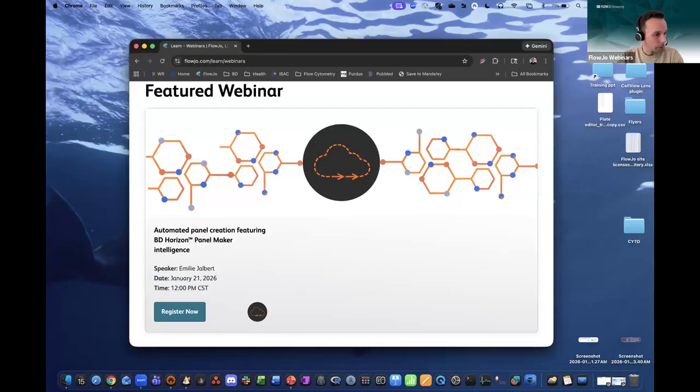The only automated QC function on FlowJo 11 is the signal stability check. Is that correct? No, so you have the flow rate, signal stability, and dynamic range. So you have 3 checks there.